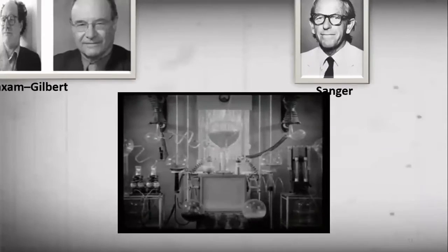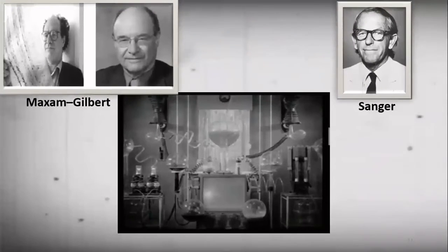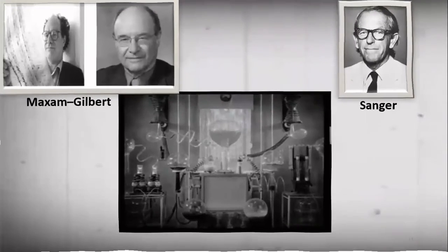Let's have a look at the methods that we can use to sequence genomes. But we have to start from the beginning. In the late 1970s, researchers tried to develop several methods to sequence purified DNA. Pioneers are Maxam, Gilbert and Frederick Sanger.